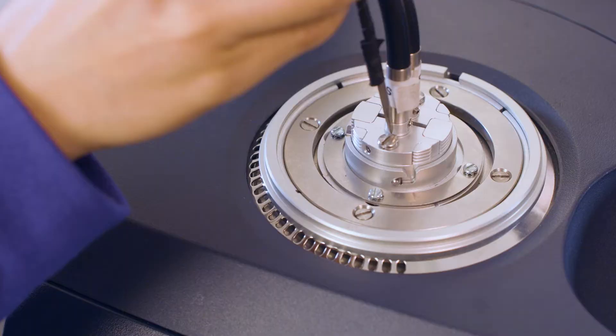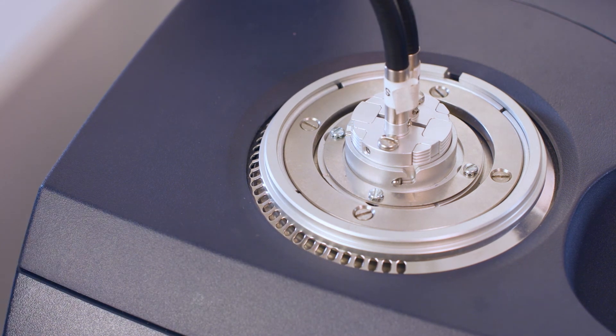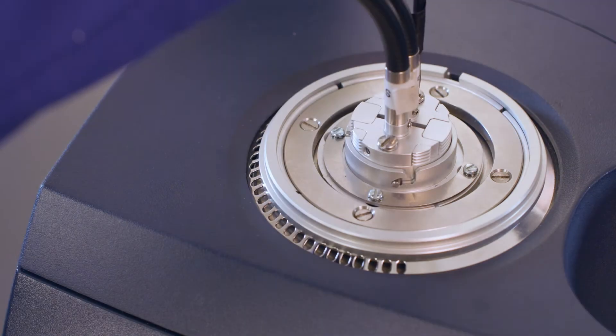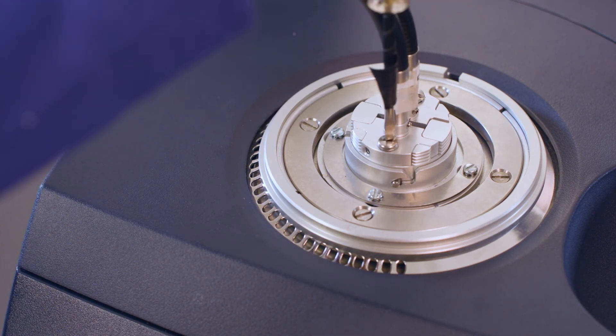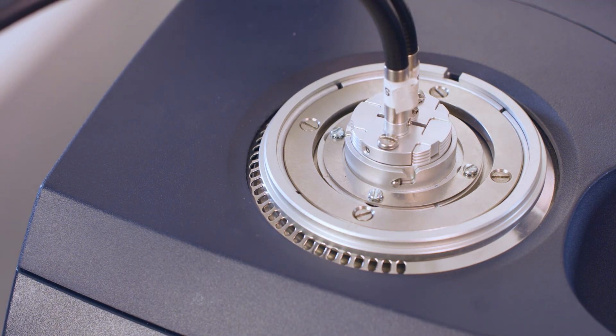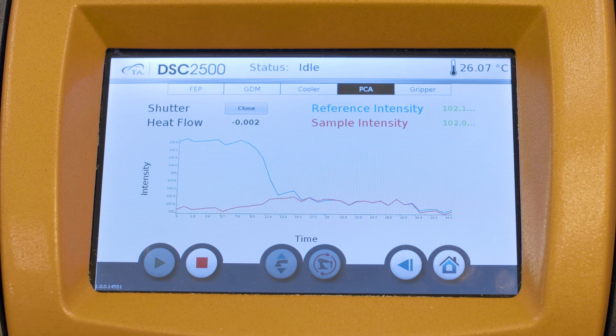Balance the intensity by adjusting the height of the light guide arm. The highest intensity can be reached when the vertical positioning screws are set at the bottom position. Turn the positioning screw counterclockwise while watching the intensity signal until the difference between the two intensities is within ±2%. The final balanced intensity is the actual intensity to which the sample in subsequent experiments will be exposed.